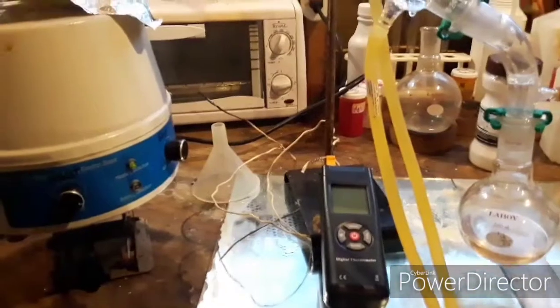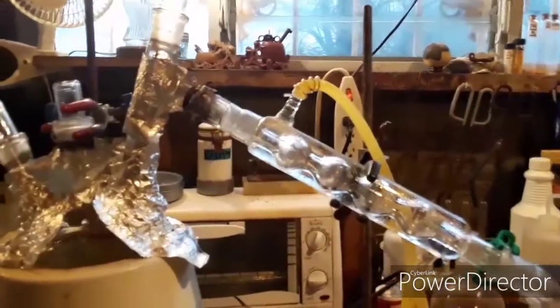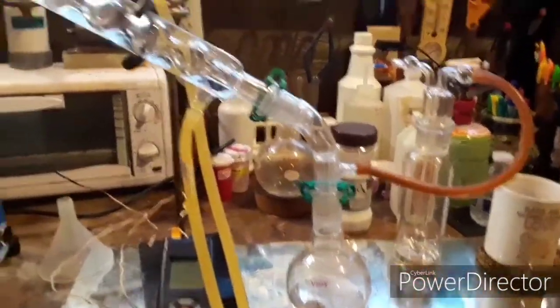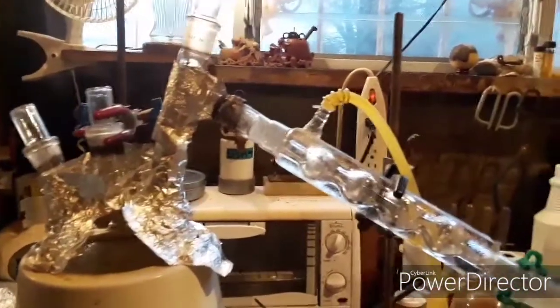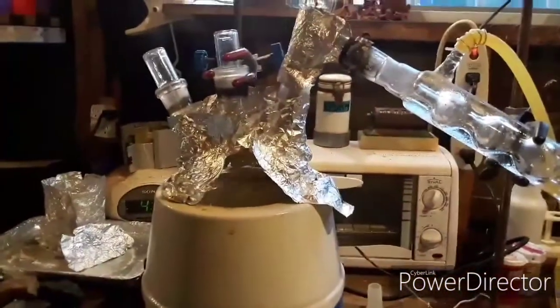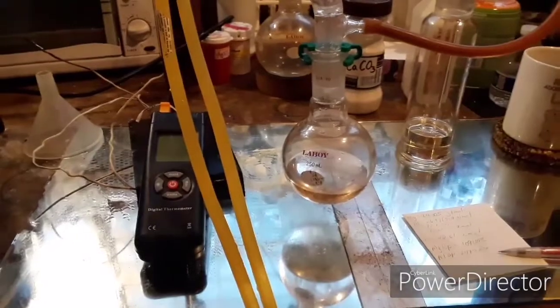I need to wait for this to warm up so I can redo my sulfur trioxide synthesis, and then I can make oleum once I have this. I don't have a thermometer in it right now because it doesn't really matter — it's coming over right around 330°C, which is right where it should be. By memory, the boiling point is supposed to be 331°C, and with slight atmospheric pressure differences it's not unreasonable for it to come over a degree or two under.